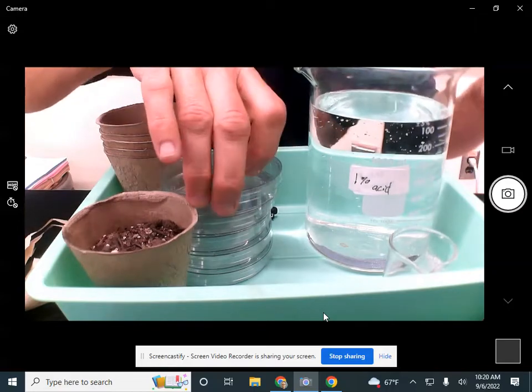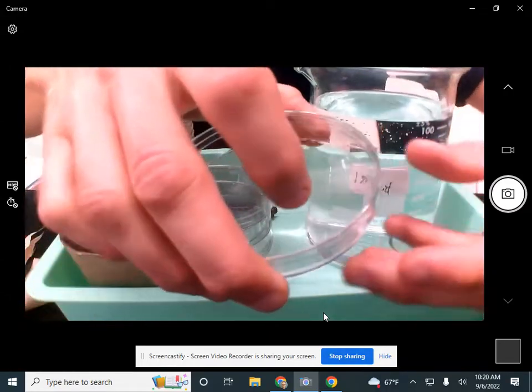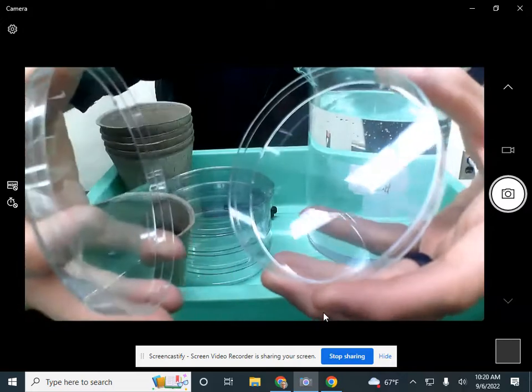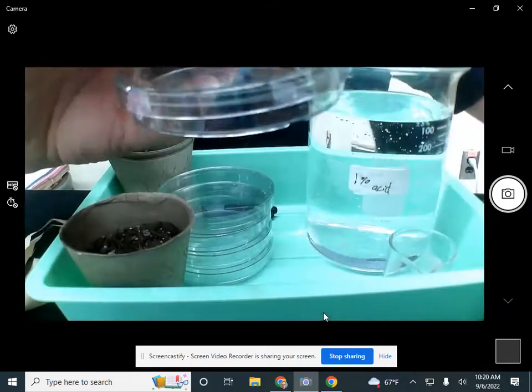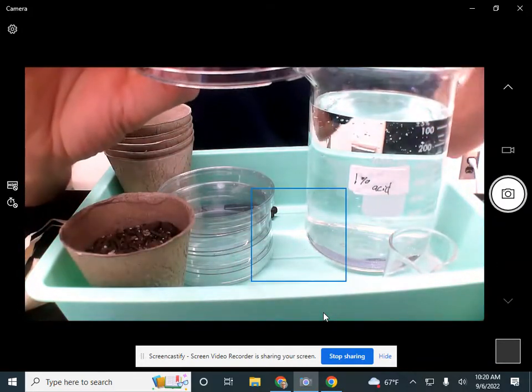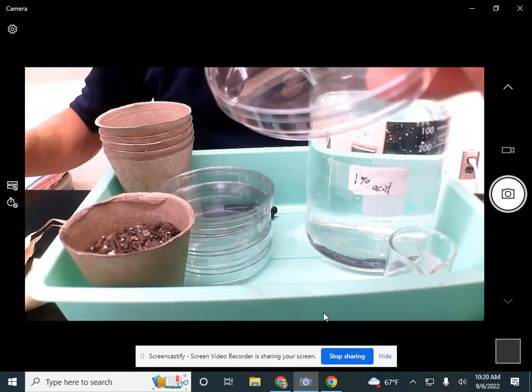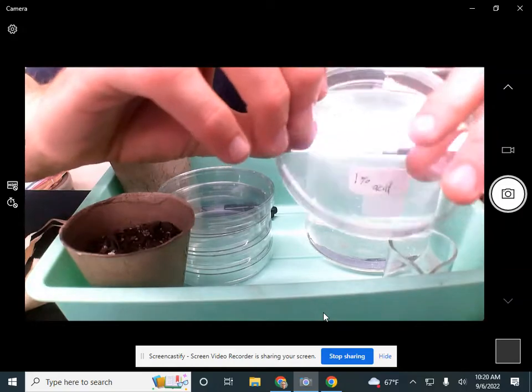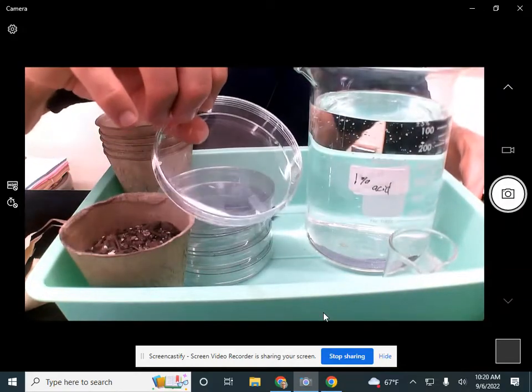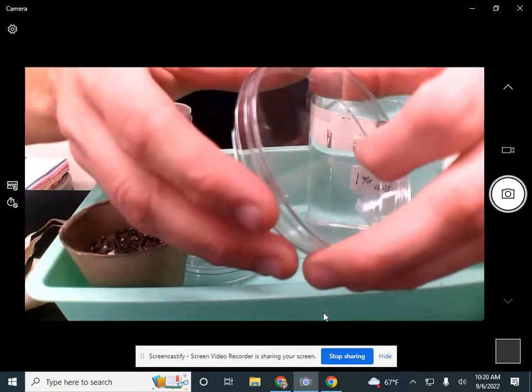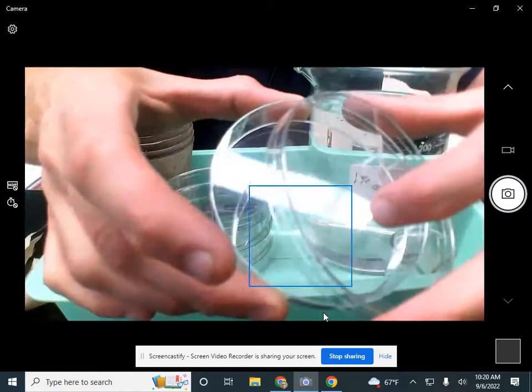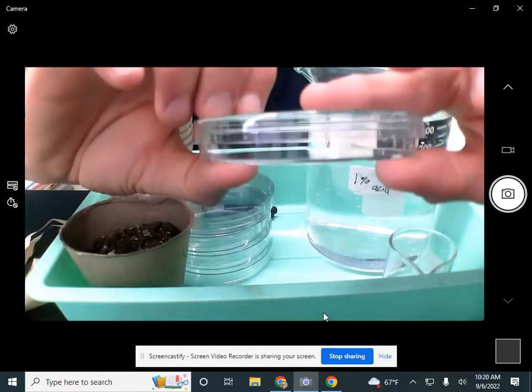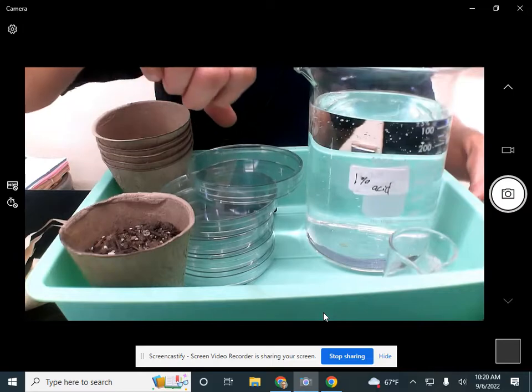The next thing you'll notice that you have is a stack of these petri dishes. They are thin, shallow dishes with a lid. And we're going to do a second experiment here, which is actually part A in your procedure. What you're going to do is take some paper towel, cut it into a circle that fits inside of this bottom. This is the bottom. The top goes over top of it, just like that.